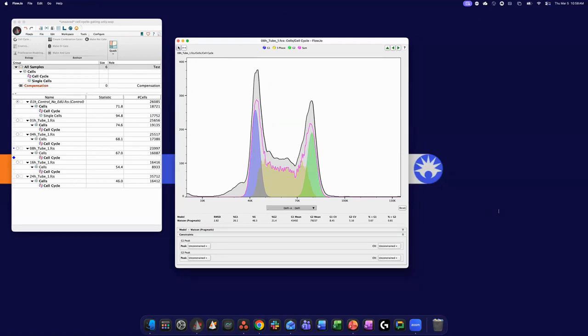So what's the suggested CV value? There's not one I'm aware of. The lower it is, the better, because that just shows the level of variability. Ideally, of course, it'd be like 0 or 1, but I don't think we usually get that low. If the number keeps increasing, that's a sign that there's a lot of variability in your cells, which could be for biological reasons, but it could also be because of suboptimal titration. So in terms of what's a good CV, I don't know if I have an answer for that. I don't know if there is one.